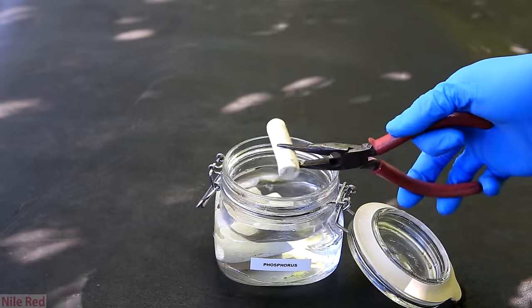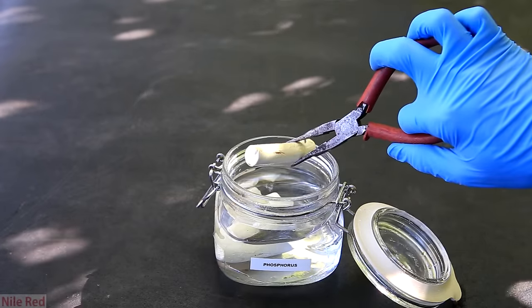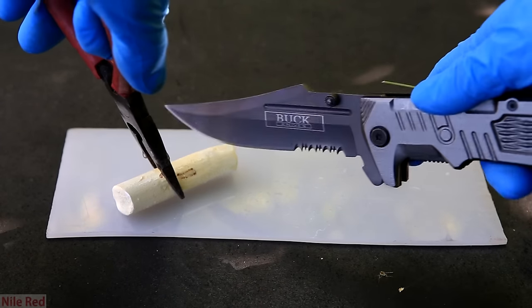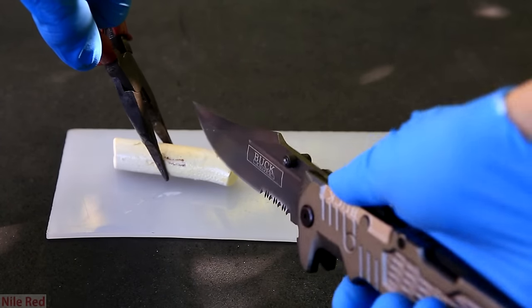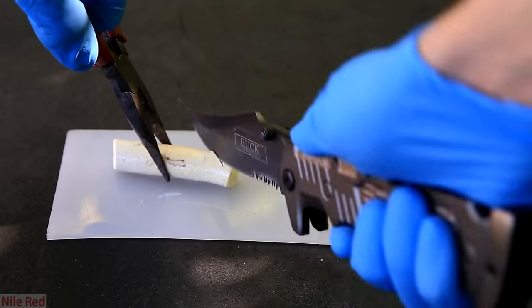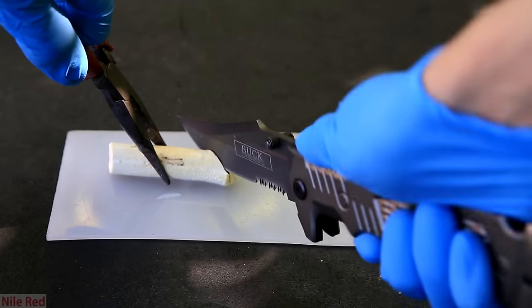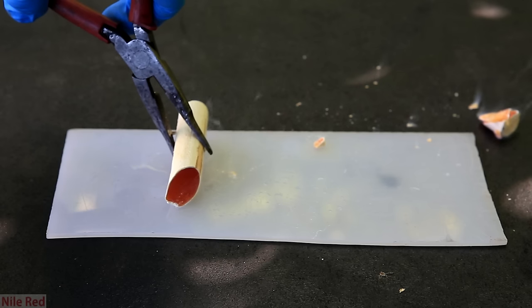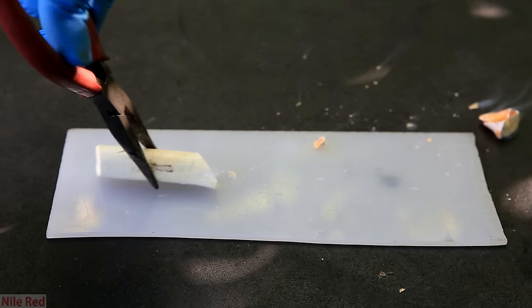I get a sample of white phosphorus, which is safely stored under a little bit of water. Then to remove a small piece, I use my knife. When I start to cut it, it looks like it's soft, but suddenly it cracks and pieces fly everywhere. From all of the shattered pieces of phosphorus, you can see white fumes of phosphorus pentoxide coming off.